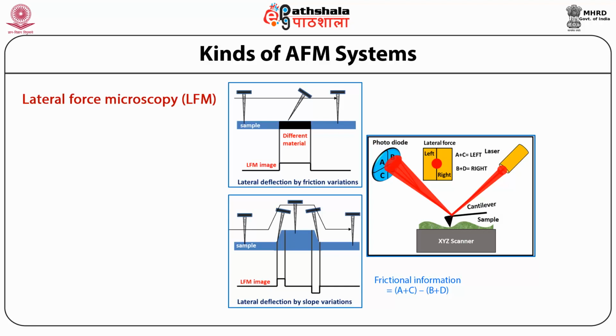Its imaging is also enhanced by edge deflection from the slope variations of surface features. This differs from the imaging of different materials by two sharp changes, up or down, at both sides.